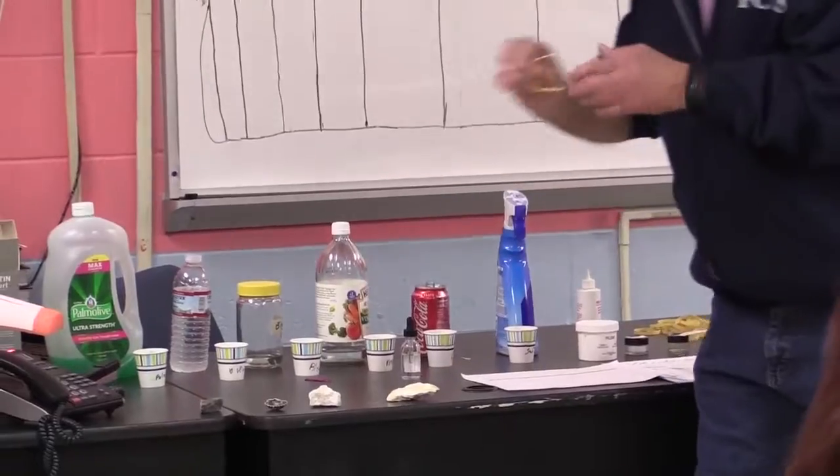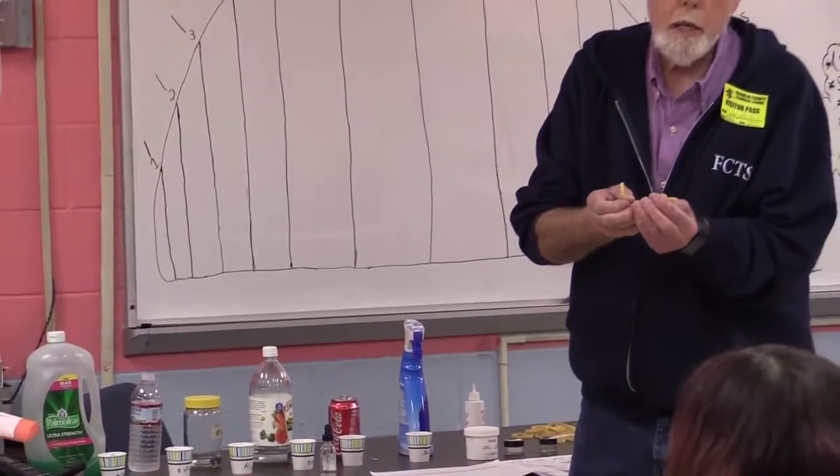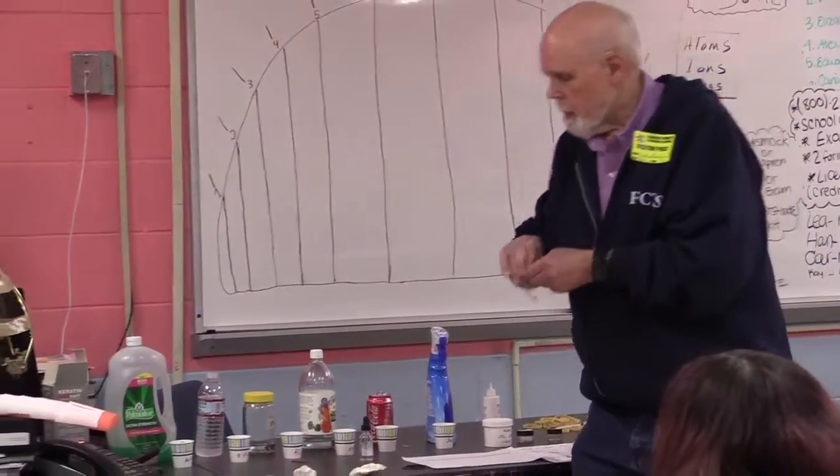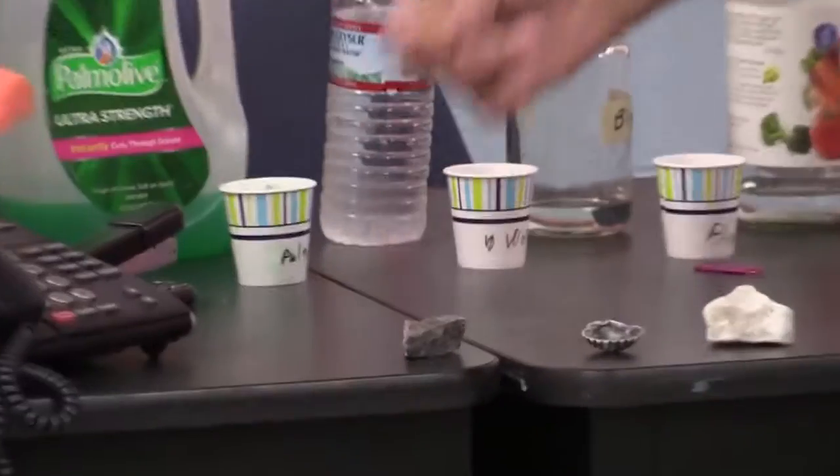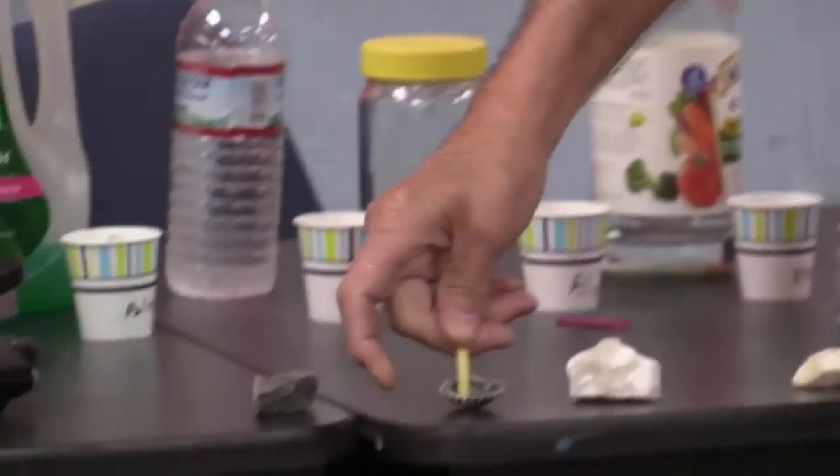Now, you remember what the acid did here? We're going to take a look now. You can see there, not as red. Neutral, didn't change at all.